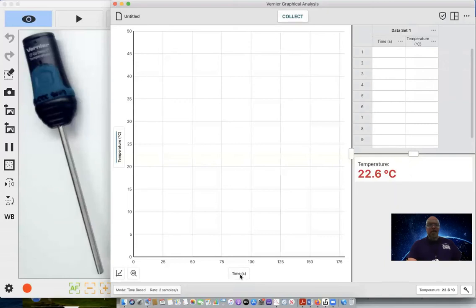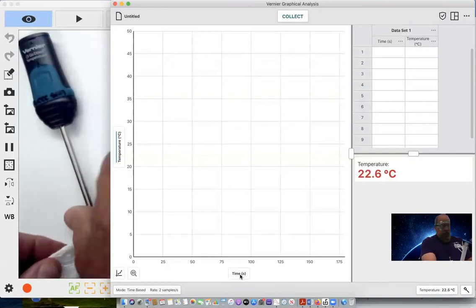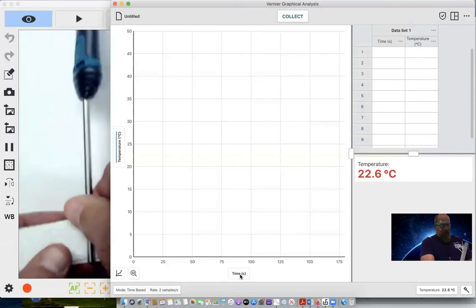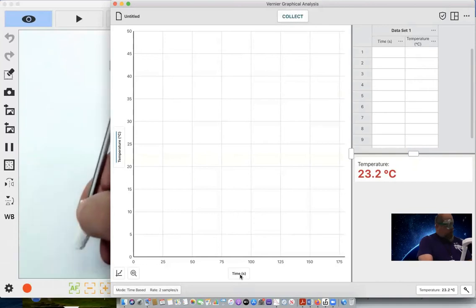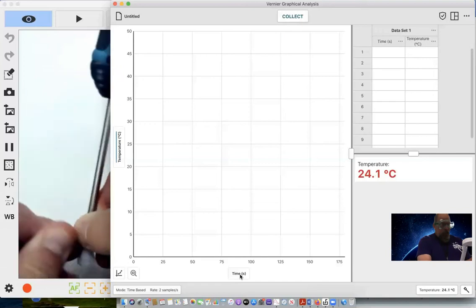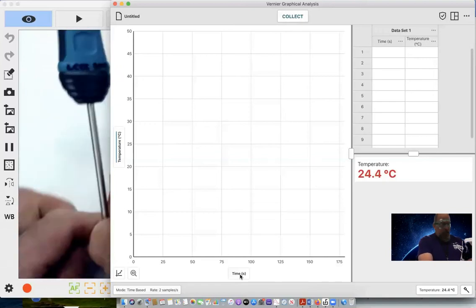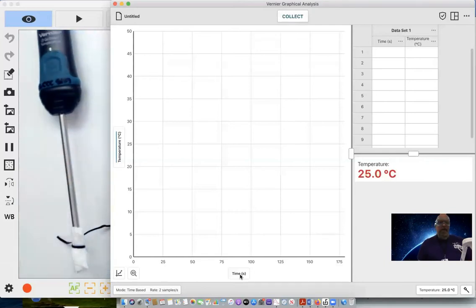It sets it up so that it will do readings for 3 minutes. To store the liquid and keep it in contact with the end of the sensor, what I need to do is take a paper towel and just wrap it around the end of the probe. So I'll twist that around and then take just a twist tie from a bread wrapper or anywhere else you can get one. And now we're ready to collect our data.